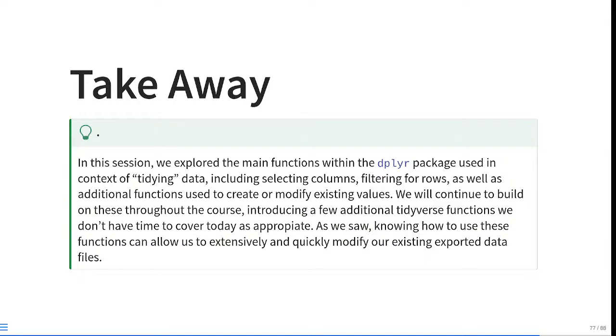And we're going to continue to build upon these and how to use pipes throughout the course, as well as add in additional Tidyverse functions that we haven't had time to cover today, as they're appropriate, because they're able to do a lot of things with rectangular and square-shaped data. And as we saw, this will allow us to quickly and extensively modify our own datasets, which cuts out the necessity of doing this all by hand and having to go through multiple hours of clicking and pasting just to get to what we actually want. Once we have it set up, we're able to quickly modify it, quickly get back what we need, and save it once again to a new CSV file.